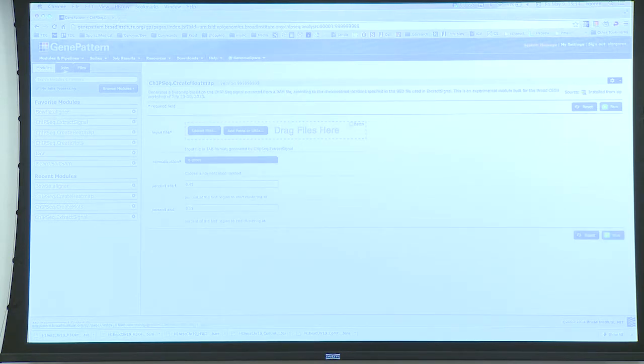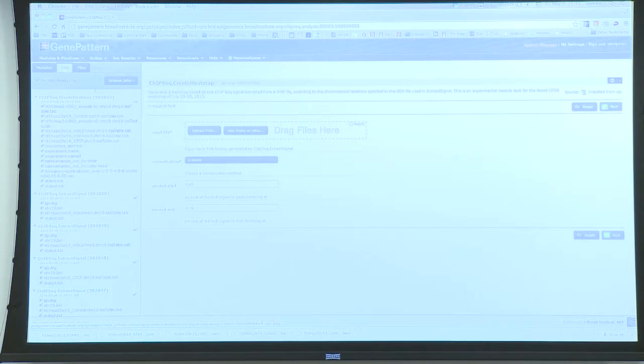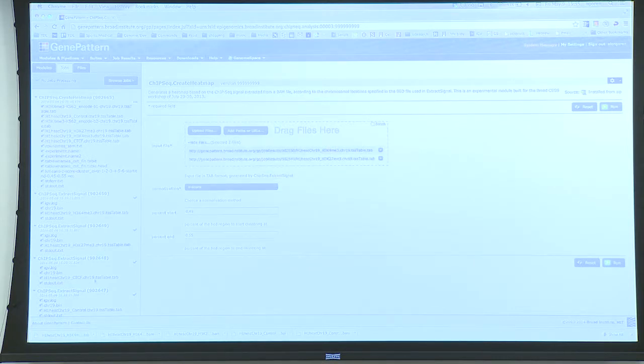And the normalization is occurring just within each file? Yes. You don't need to have all the files from the same experiment? No, again, this depends. In general, we also implemented a way that it can normalize to the whole cell extract. So then you would want a whole cell extract for each experiment. But here we didn't. If we add these other files for replicates later, we don't have to normalize them the same way. No.